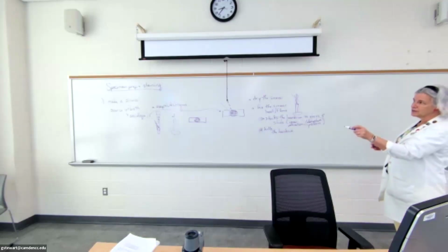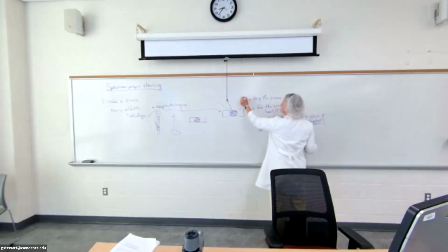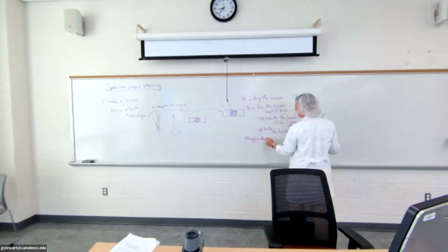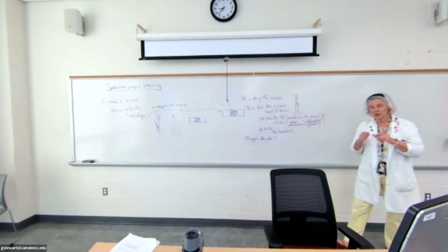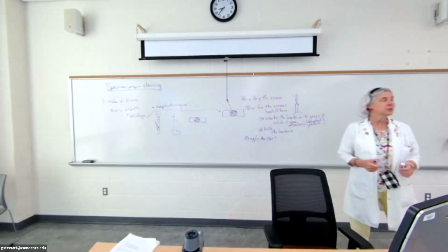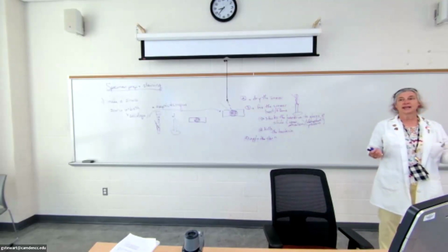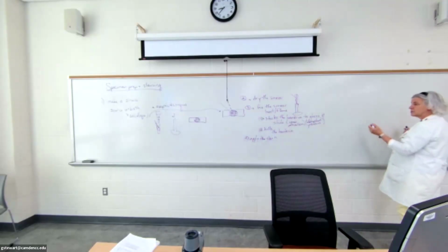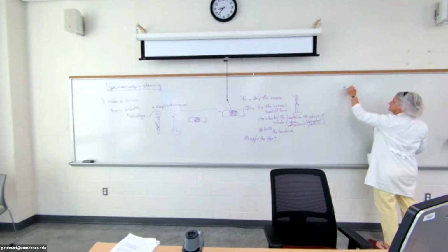All right, so we make the smear, we dry the smear, we fix the smear. Now we can apply the stain, number 4. Depending on what the charge of the stain is and how many different stains we put on, those staining procedures go into categories. The first is what we call a simple stain.